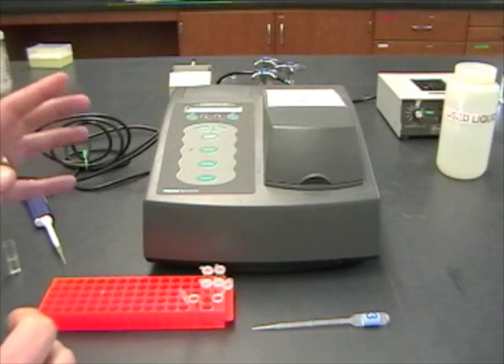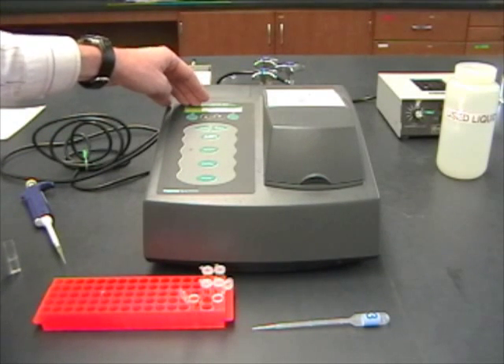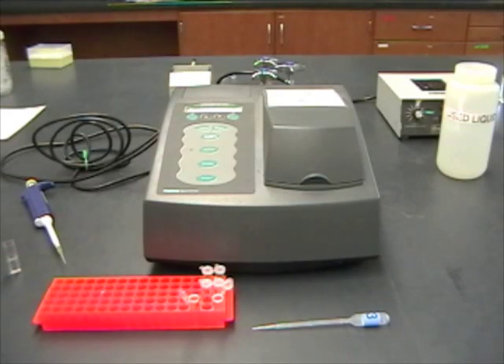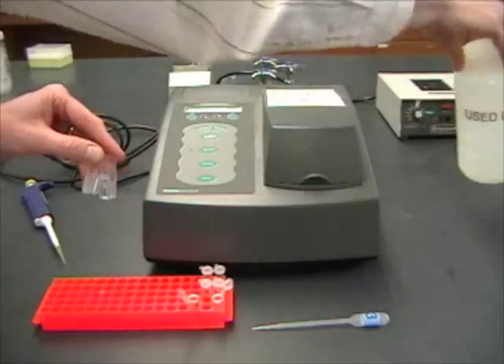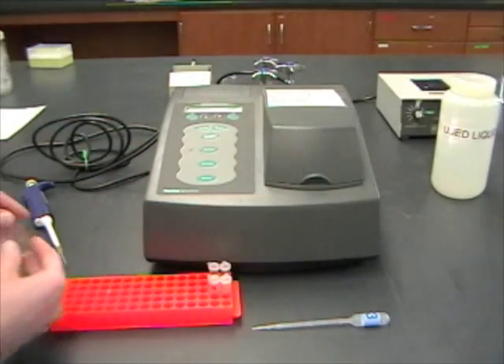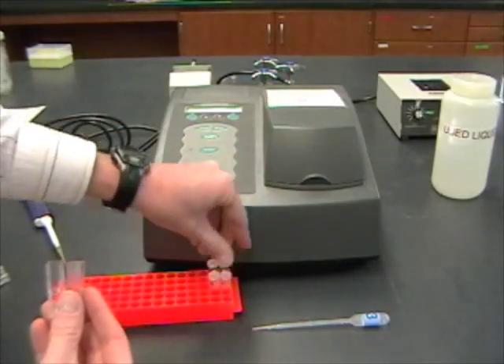It's important to remember: when we were checking for the number of cells, this was set at 600 nanometers. For checking for that yellow product, it's at 420 nanometers. When this is done, I can dump both of these out — everything goes into the used liquid containers. Then for the 20-minute time point, I have a new blank and a new test tube.